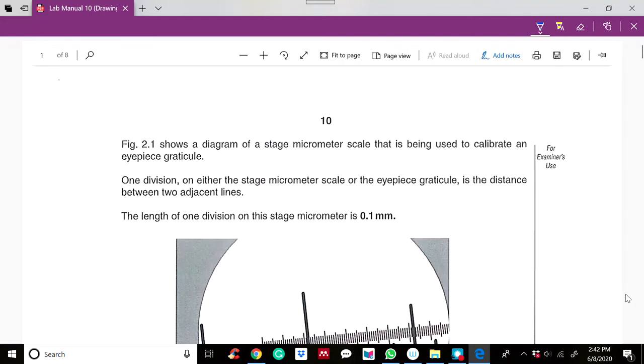In this video, you will learn how to calibrate an eyepiece graticule and use it to measure the actual length of a microscope image.